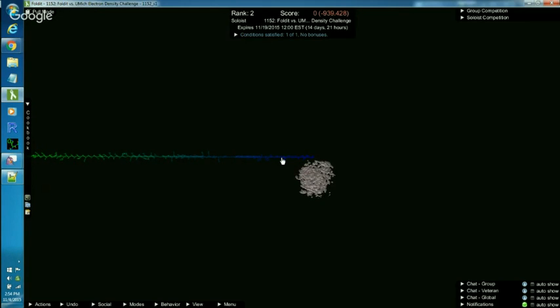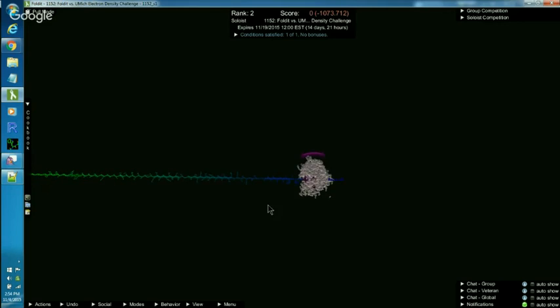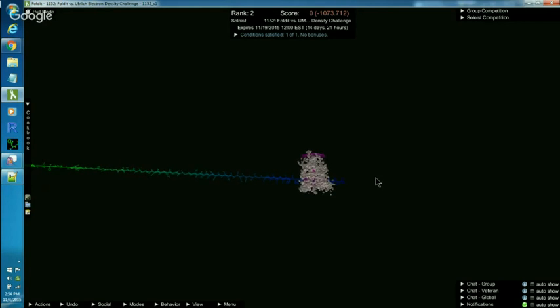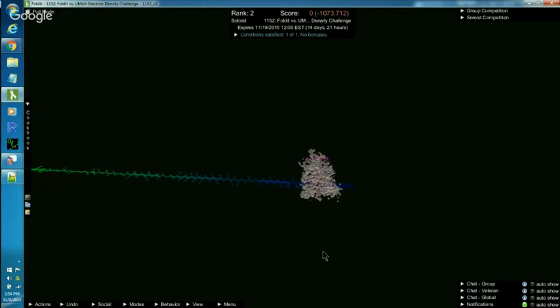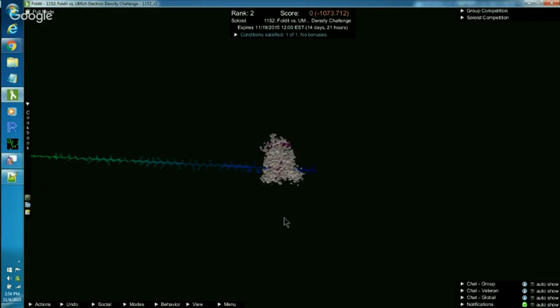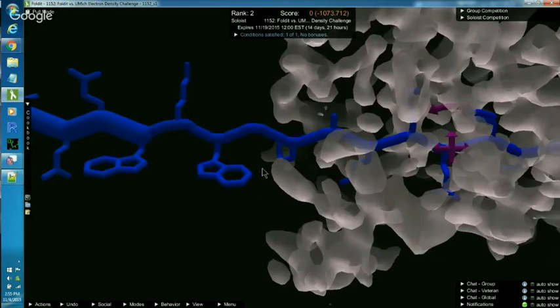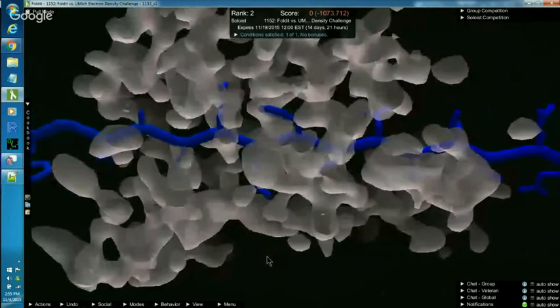And I'm going to move this backbone into the middle of the cloud because that's going to give me visibility inside the cloud. Let's zoom in a bit. I'm going to put my mouse on the backbone and hit Shift-Q. This is going to zoom in and also cut away some of the cloud to make the inside more visible.